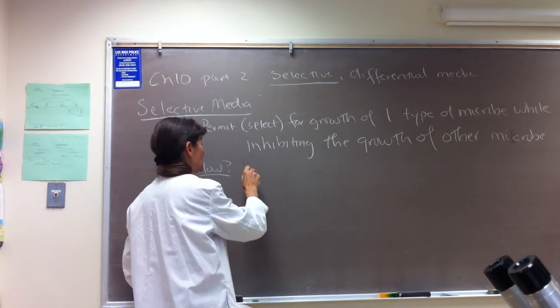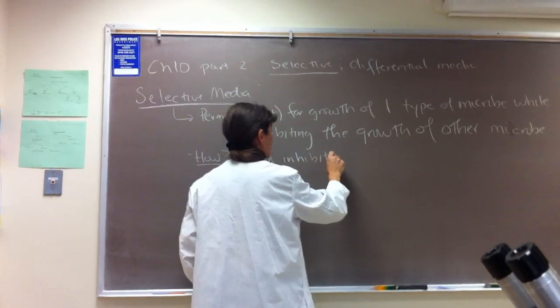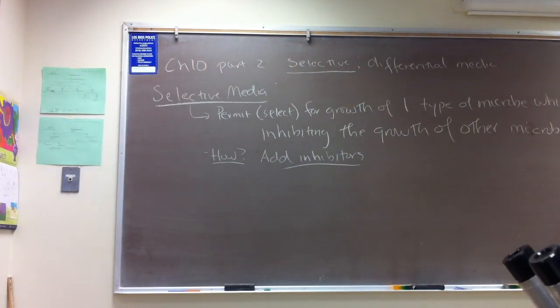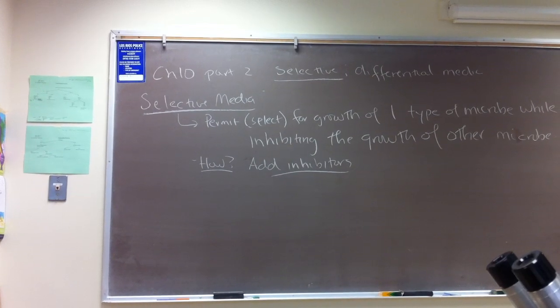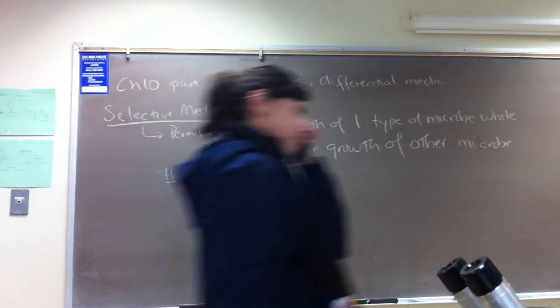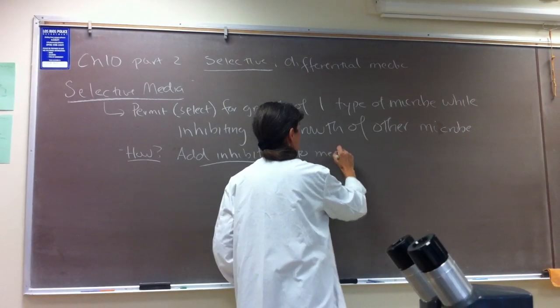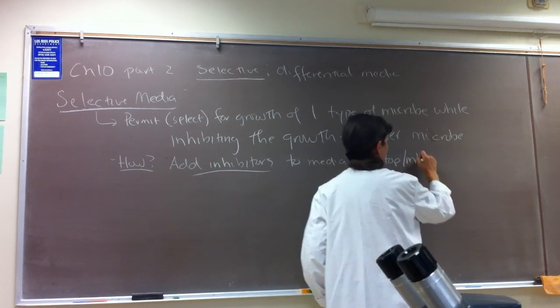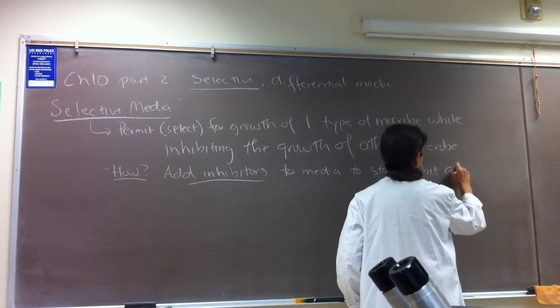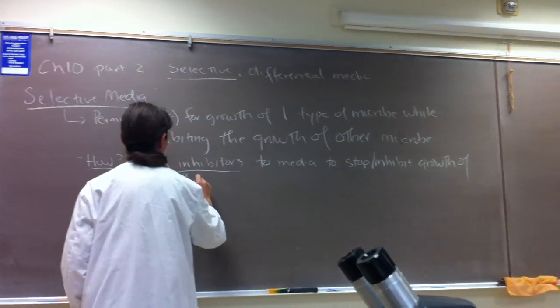So we're going to add inhibitors to media to stop, and again, stop means to inhibit the growth of the undesired microbes.